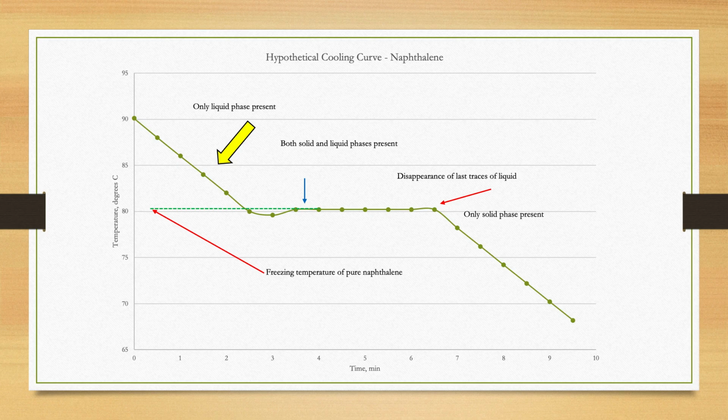and that will help us identify where our freezing point is. And what we'll look for, if we do see this little rise in temperature that we saw here, where the blue is the peak of that, where it rises back up to, that's what we actually call our freezing point for that particular liquid. Like I said, a lot of times we're not going to see that rise. That's okay. We're just looking at the plateau. Wherever we see our plateau, that is our freezing point instead.